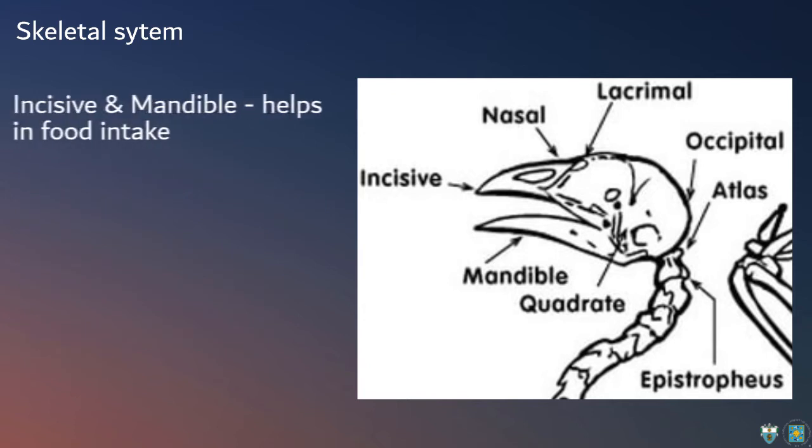Incisive and mandible are the ones responsible for food intake with the help of the hard beak and their strong tongue.